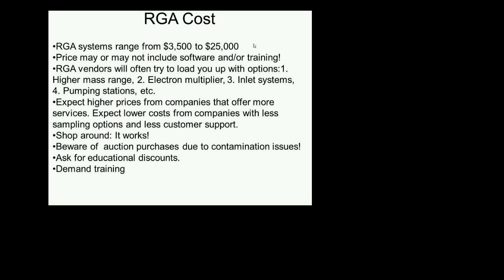But what you have to be very careful about is that very often low cost goes with no help. So in other words, you're not paying much for the unit, but you're also getting no help with the unit. What I have found in my experience over all these years is that vendors that charge more money do so because they're willing to have an applications engineer either talk to you, visit you, install it for you, or train you on its use. And of course, somebody's got to pay for it.